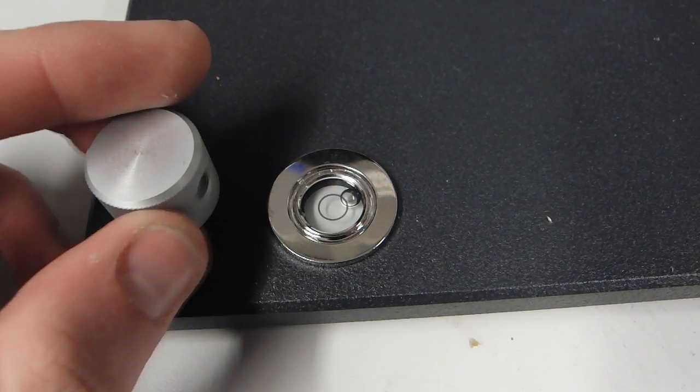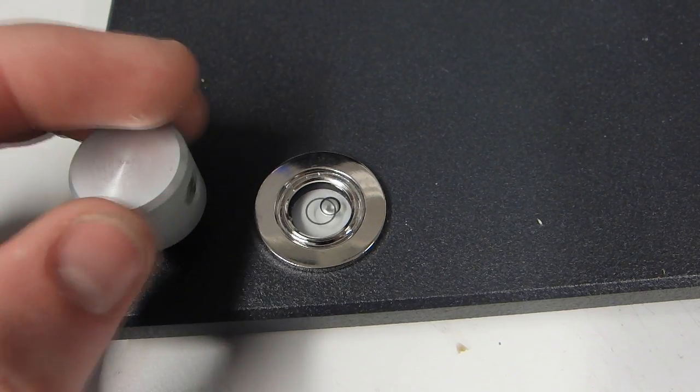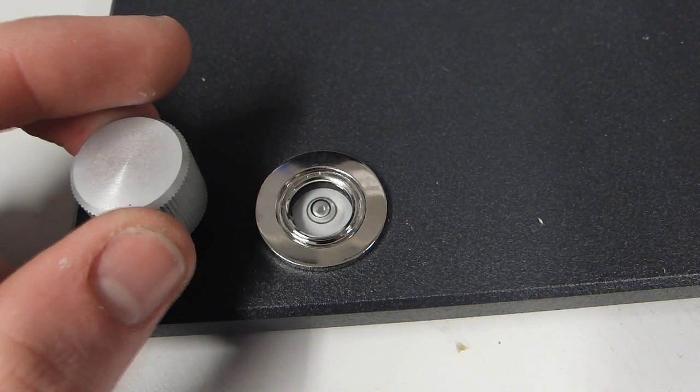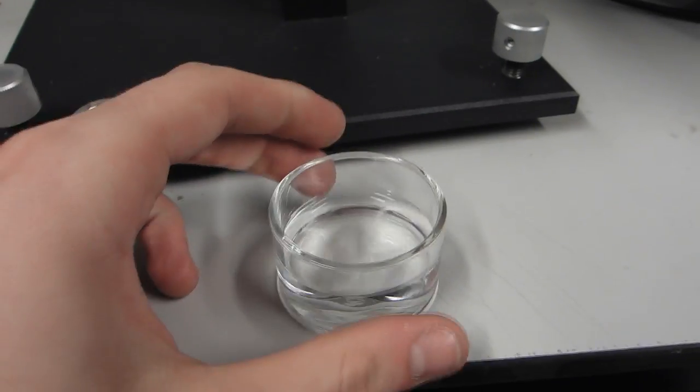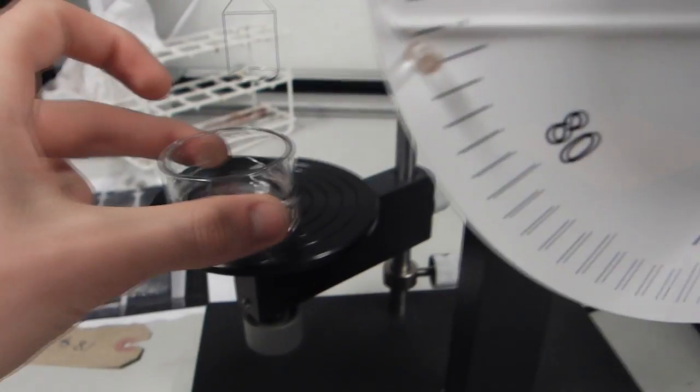To begin making a measurement, we first move the level adjustment dials until the spirit bubble is centered. We then take the sample and place it on the stage.